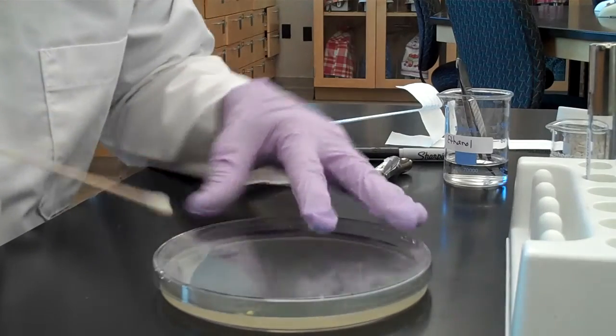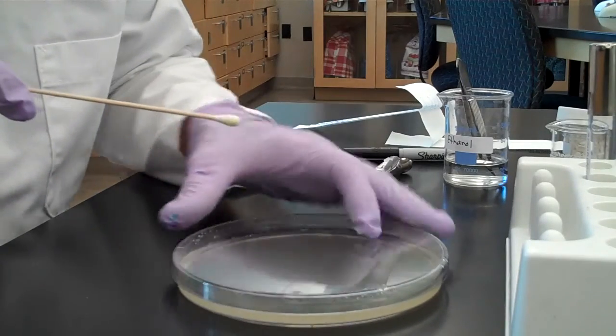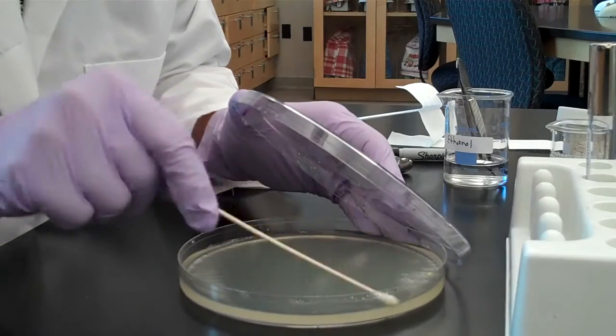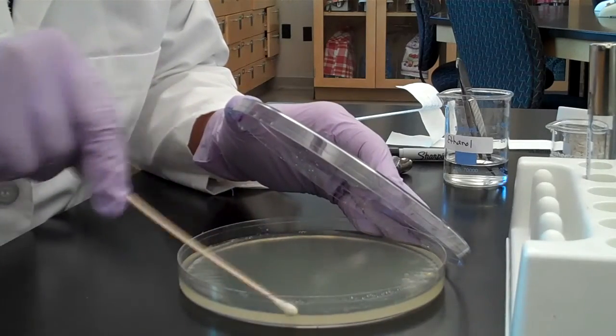And now one more time, turn your plate 90 degrees, back and forth, to make sure you cover every little bit of the agar.